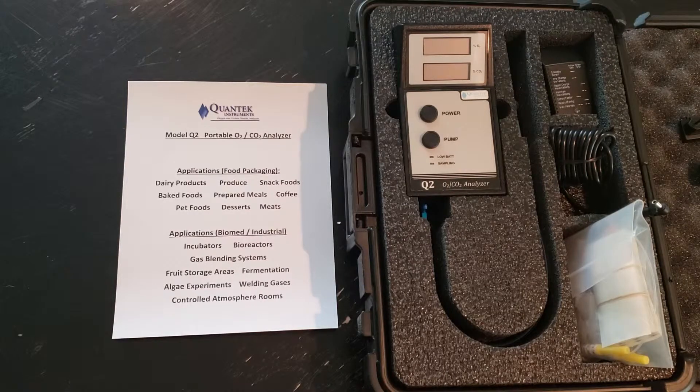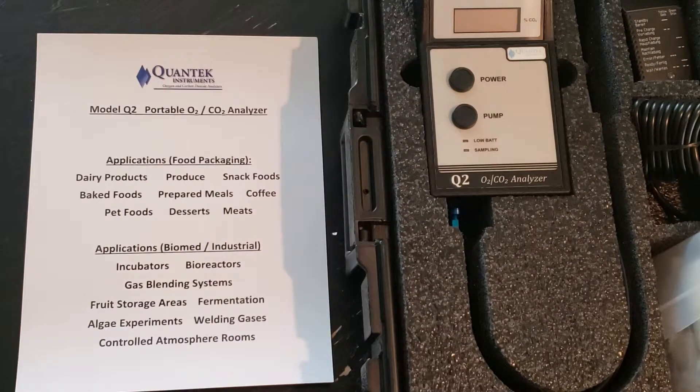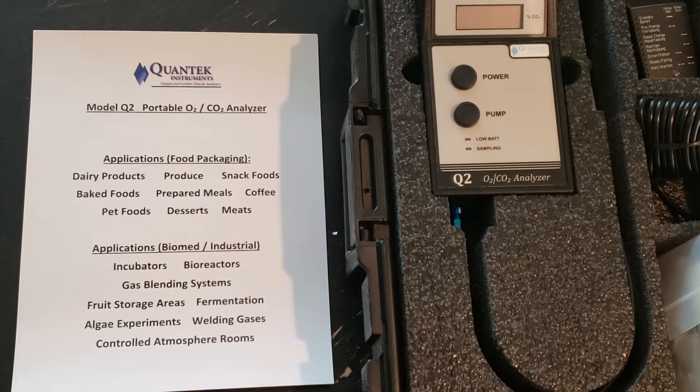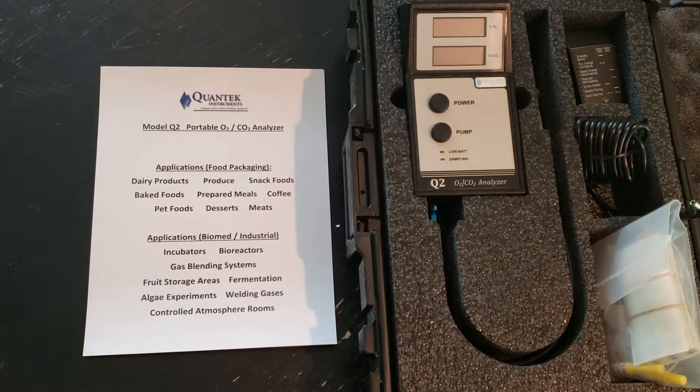This is a quick introduction to our Q2 portable O2/CO2 analyzer, which is typically used for testing food packages such as dairy products, produce, and snack foods, or a various number of other applications, including scientific applications, IVF incubators, and cell culture incubators. Let's take a quick look at the instrument itself.